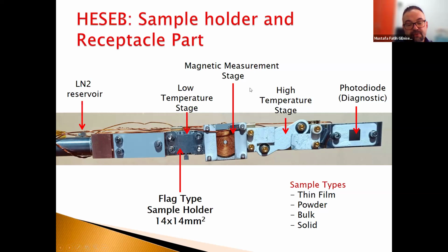And it's a magnetic stage for XMCD measurements. And we have a button heater for high temperature measurements. At the end of our receptacle part, we have a photodiode, which is not related to the users, but it is for diagnostic tools. It's a diagnostic tool we need.